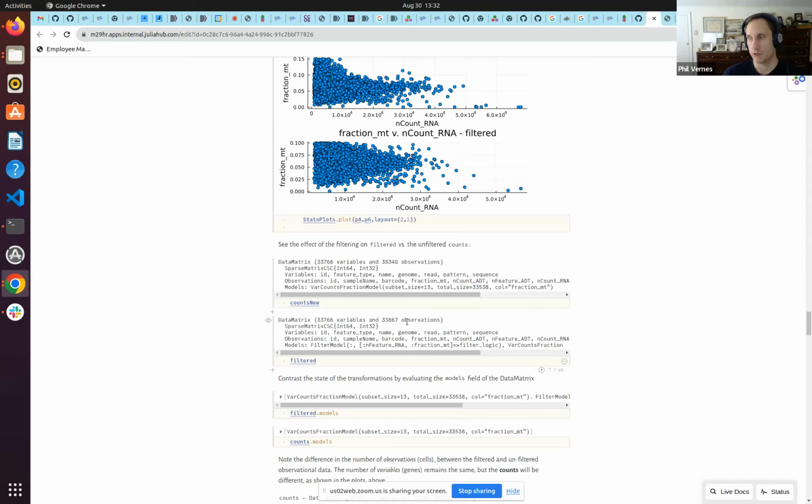Because we lose cells, one of the main tasks of this package is to keep a correct count of annotated data, so that we don't double count or miscount the annotations as we transform or remove count data. So you can see it here very explicitly. The gene count is consistent, but the cell count has changed. Obviously it's gone down since we filtered.